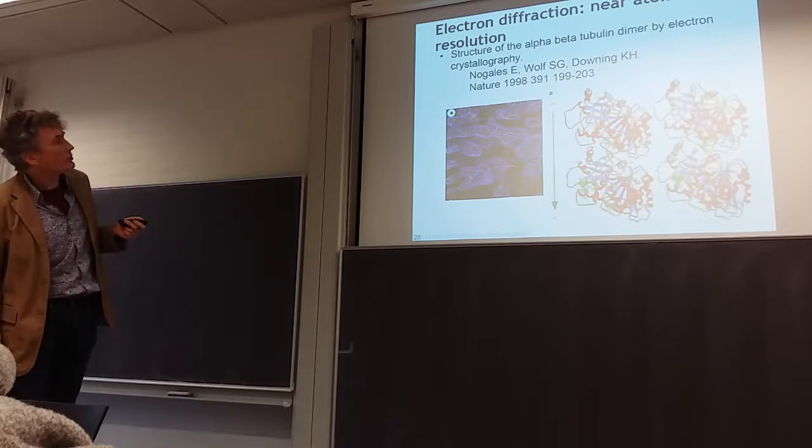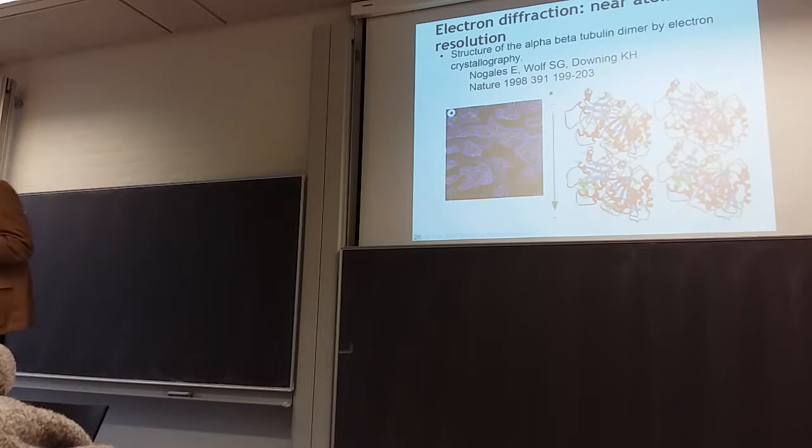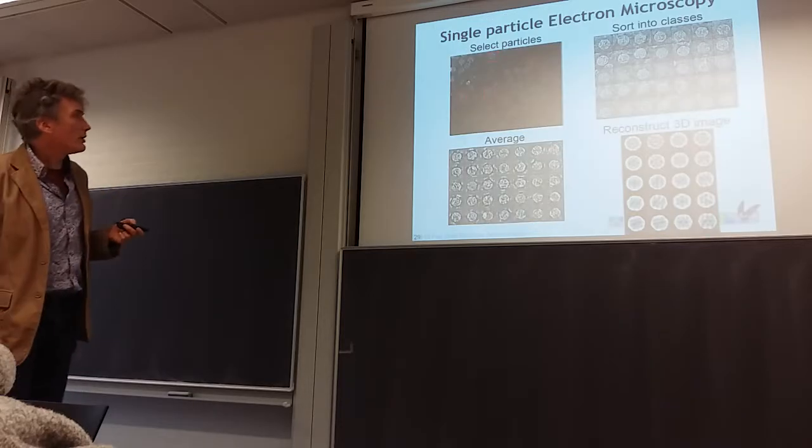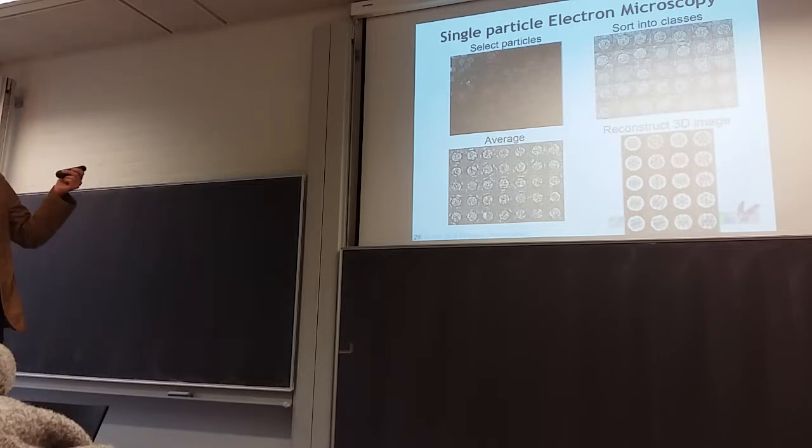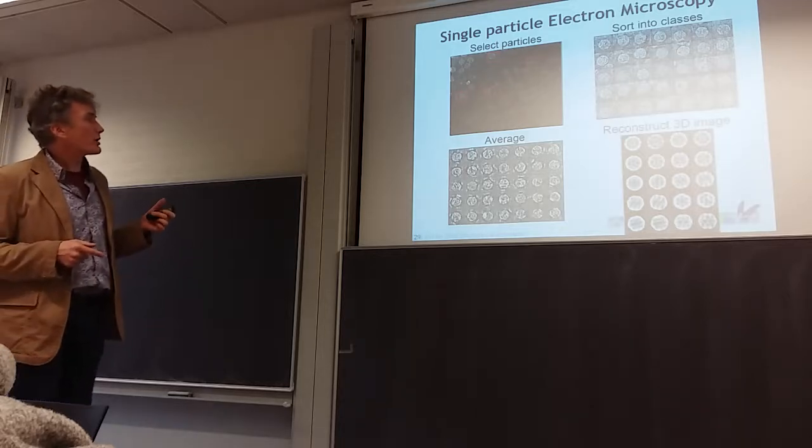That was already a while ago, 20 years. Okay, so this is electron diffraction. Now back to electron microscopy. I already had the electron 2D diffraction. This is single particle imaging.